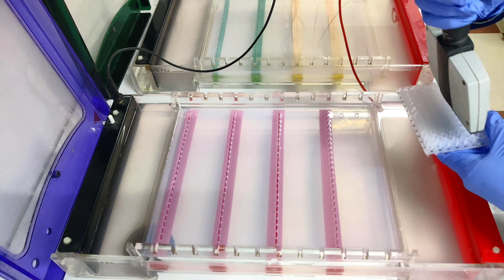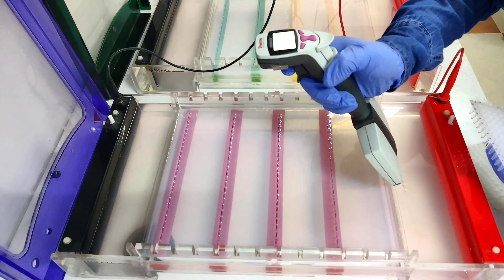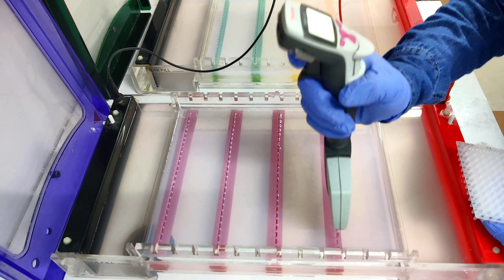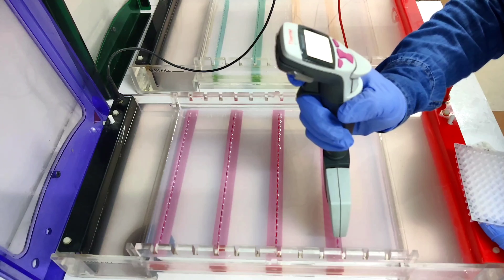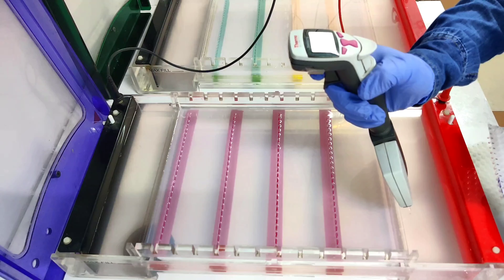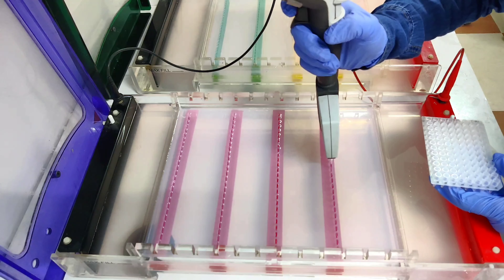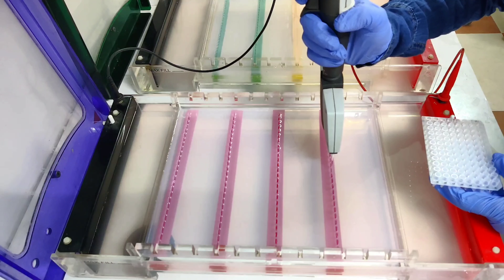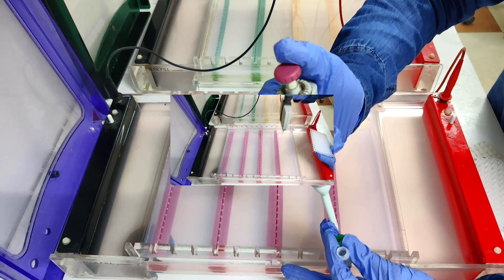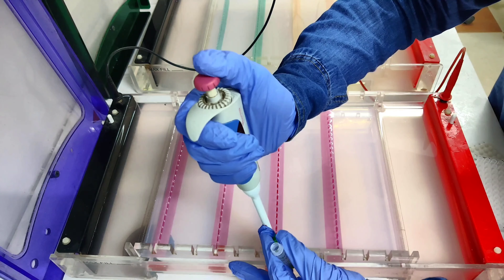You can save the time, you can save the resources. No need to remove this gel — after two hours we can load the second plate in the same gel. For identification of the PCR product size we have to load the ladder. This is the 100 base pair DNA ladder.